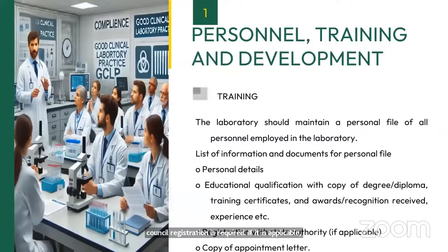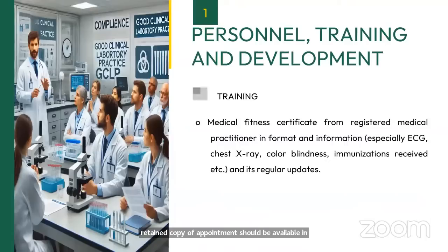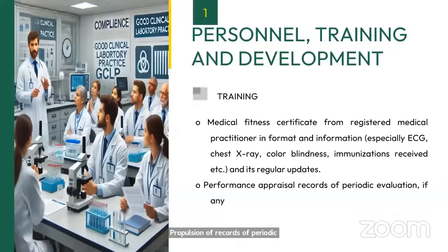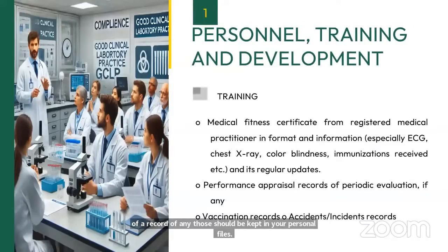Copies of appointment letters should be available in your personal file. Medical fitness certificate. So there should be a fitness. If you are working in a laboratory, you should be fit to work in that environment. So your fitness certificate from the registered medical practitioner should be available. Performance appraisals, records of periodic evaluations, if any, should be kept in your personal files. Vaccination records, records of accident, incident should be kept in the file.